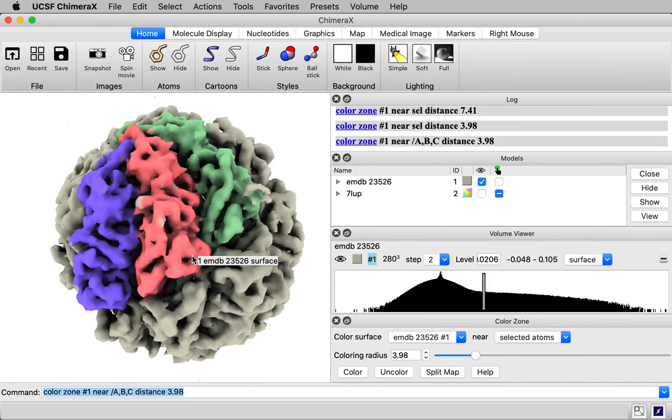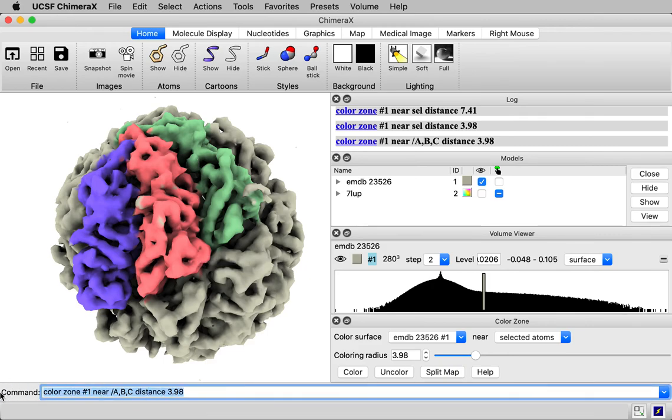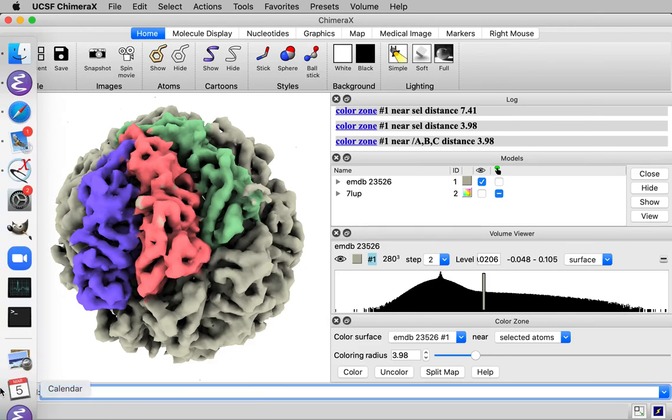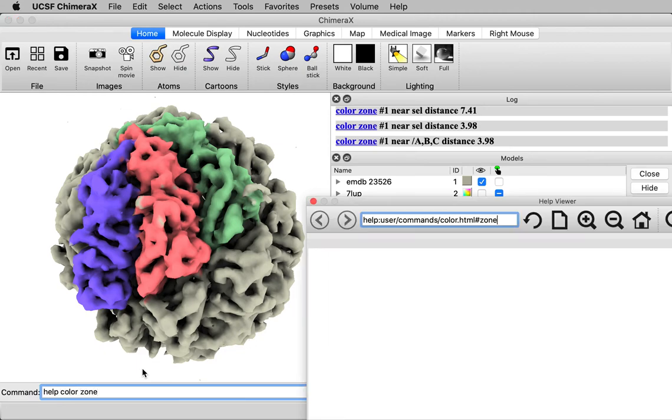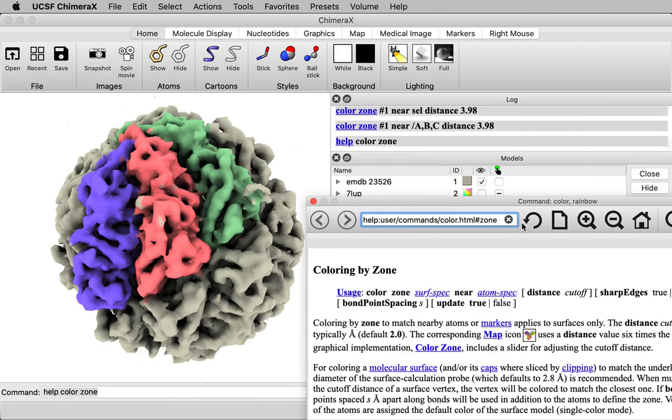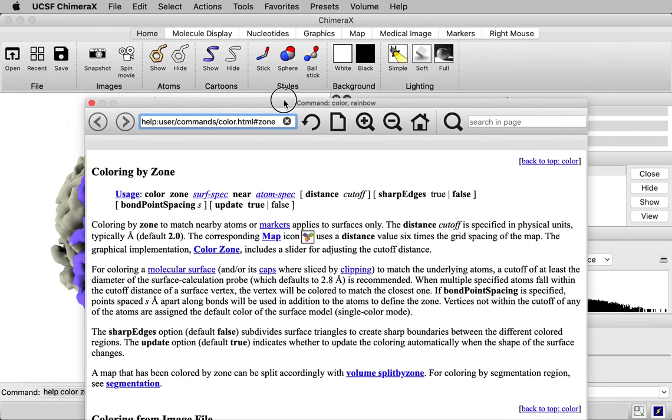If you want to know more information about this color zone command, there are additional options, you can say help color zone. And that will bring up the documentation in a browser like so.